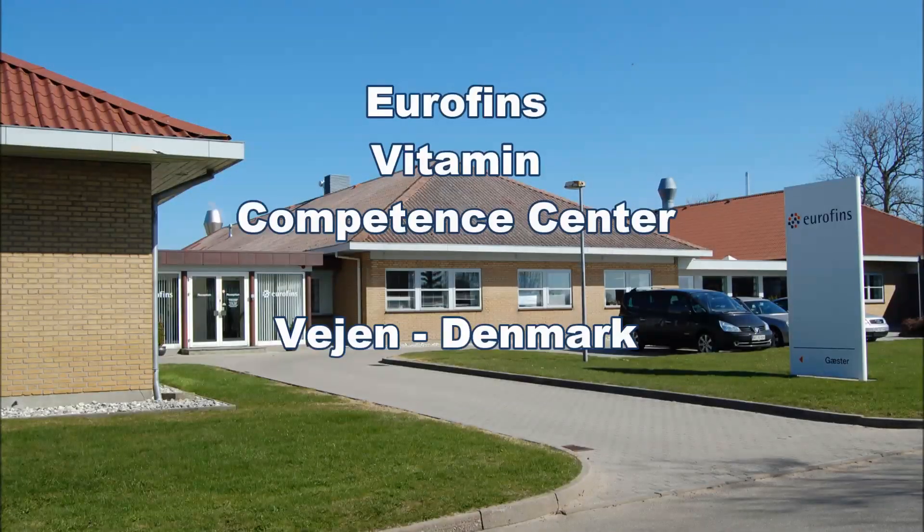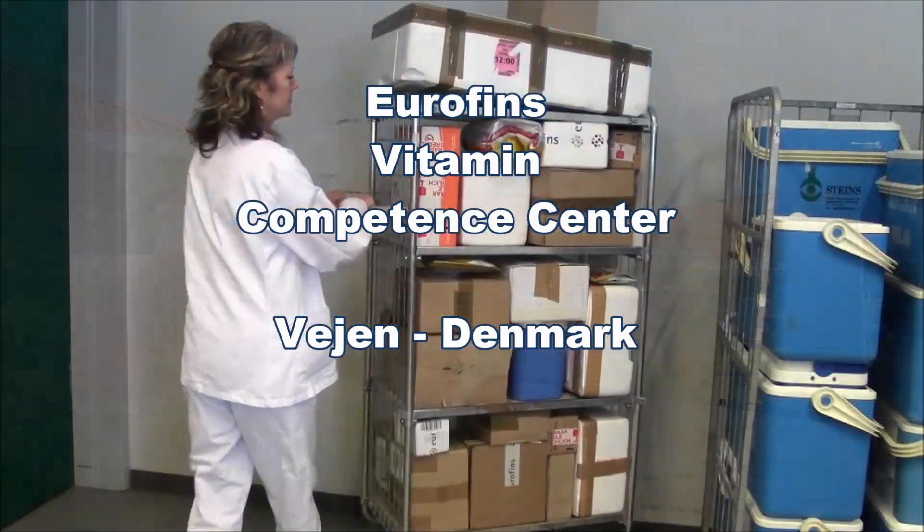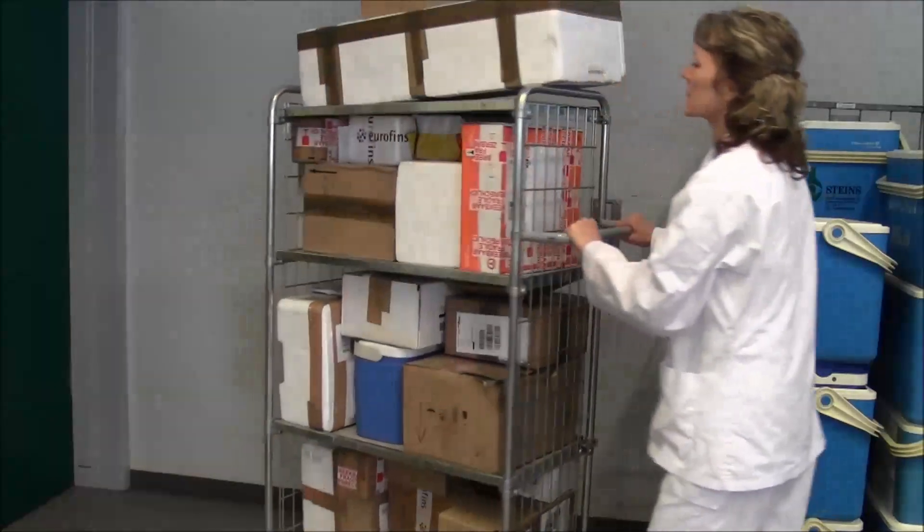Welcome to Eurofin's Vitamin Competence Center. We would like to give you a tour around our lab from a sample's point of view.